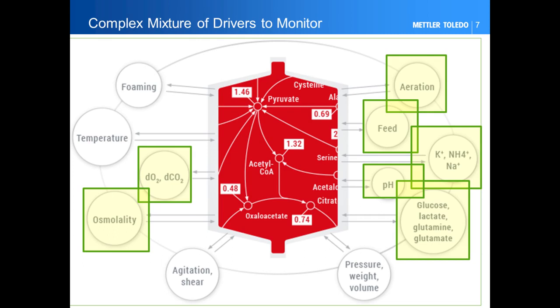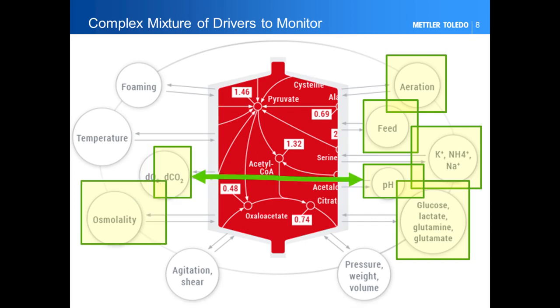And this is difficult to track if you don't look at CO2 as a critical parameter affecting the pH. So it's important to be sure that at least CO2 to pH and pH to CO2, both accuracy are maintained all over the process.